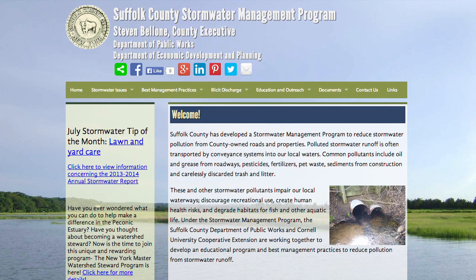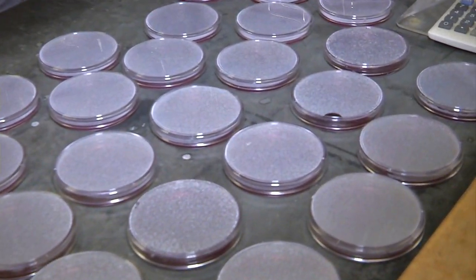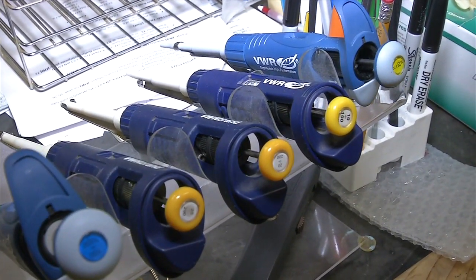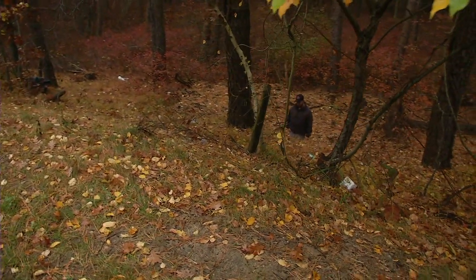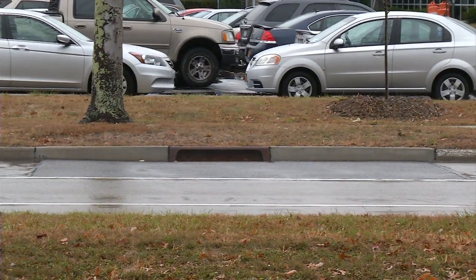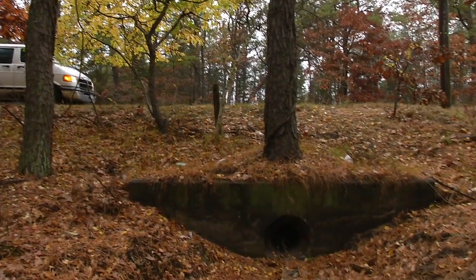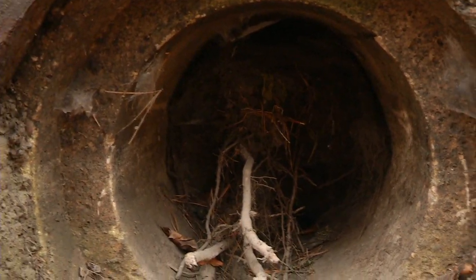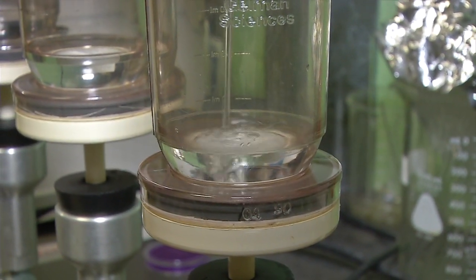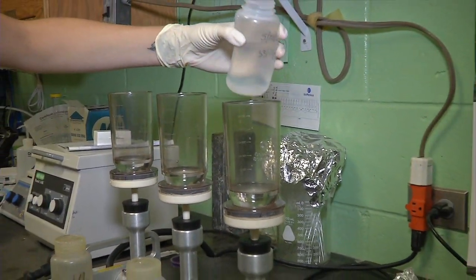Our biggest project that we use the water lab for is probably with the Suffolk County Stormwater program, and within that is the Illicit Discharge Detection and Elimination program. Now, the Stormwater program is a federally mandated program that comes from the EPA, so we help them manage their program for the stormwater. Within that, we do the water testing, and that includes looking at all the outfall pipes or any county roads that may be discharging to water bodies. So basically, we're within every township within the county. We have about 300 different outfalls within the county, going all the way from the border at Nassau County out to Orient Point and Montauk Point. So we cover a large amount of area looking at these different pipes that may be discharging stormwater, and whenever we find anything coming out of those, we are testing it. So we're looking at bacteria inputs from all the townships within Suffolk County.